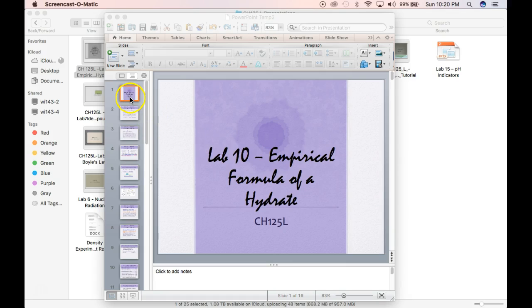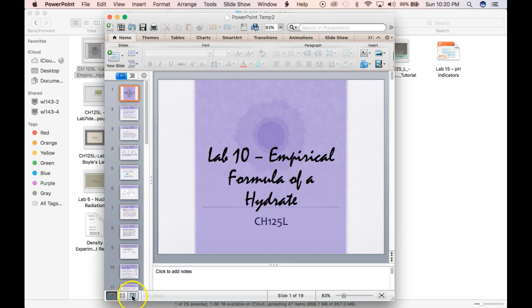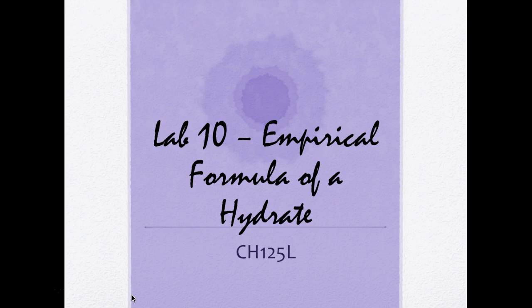When you heat the hydrate, you will find that the water of hydration will leave that crystal structure, vaporize, and come out, leaving the compound, which is called an anhydrate, which is the substance without that water of hydration.